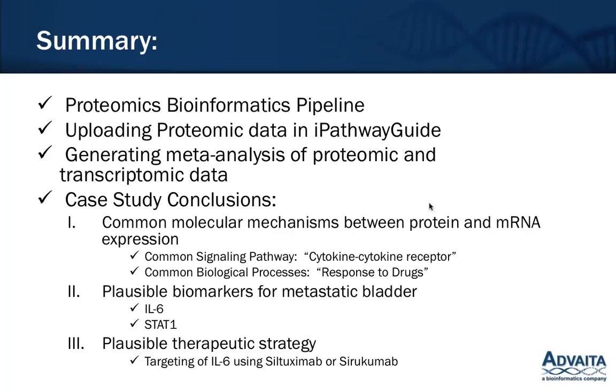And I also showed you how you can generate a meta-analysis report comparing both protein and mRNA expression data. And then in the case study, in which I went over the comparison of a metastatic bladder cancer cell line versus a non-metastatic bladder cancer cell line, I compared the mRNA expression with the protein expression to show the common molecular mechanisms between the protein and mRNA expression that are listed here, the common signaling pathway, as well as the biological process.